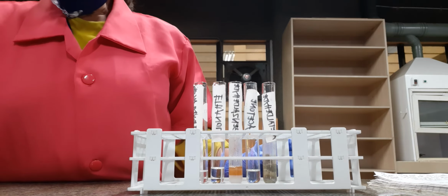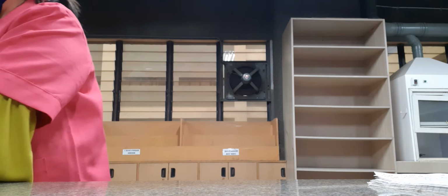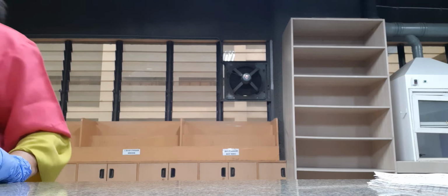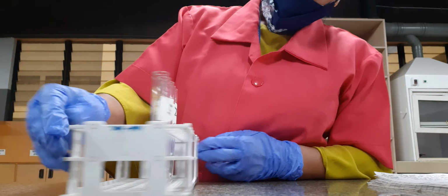Okay, so while waiting for our substance, we move on to our next test, which is Fehling's test. Okay?